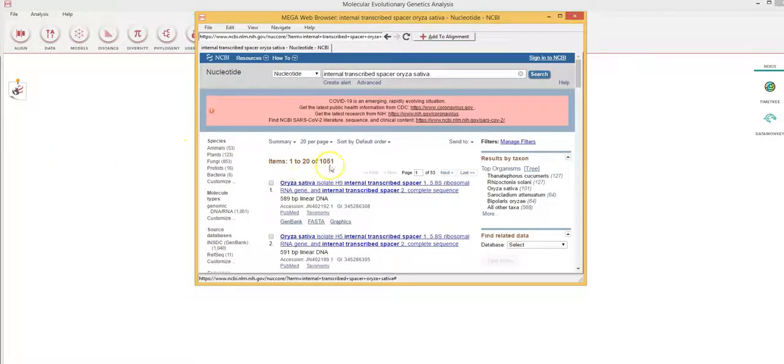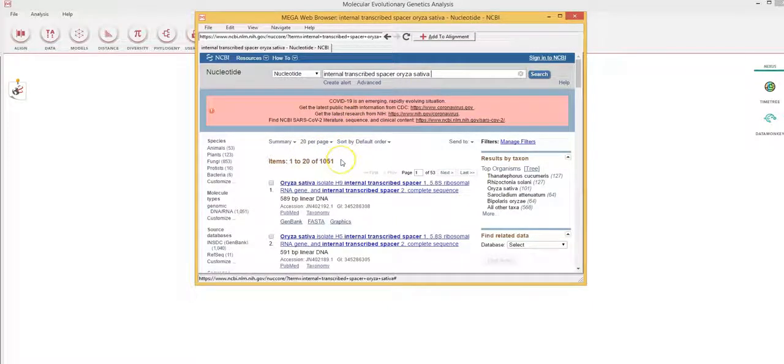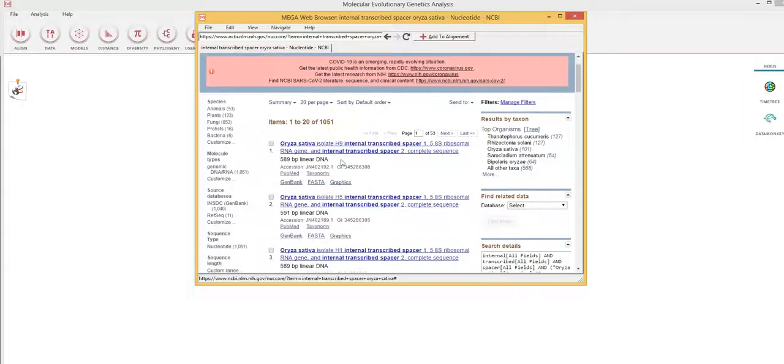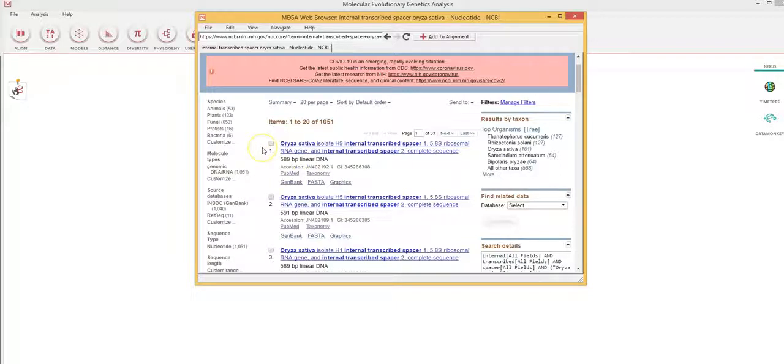So there are multiple sequences within the NCBI gene bank. I have about 1051 sequences, but I don't need so many. So I will select the basic number of sequences to construct this tree, which is around 20.